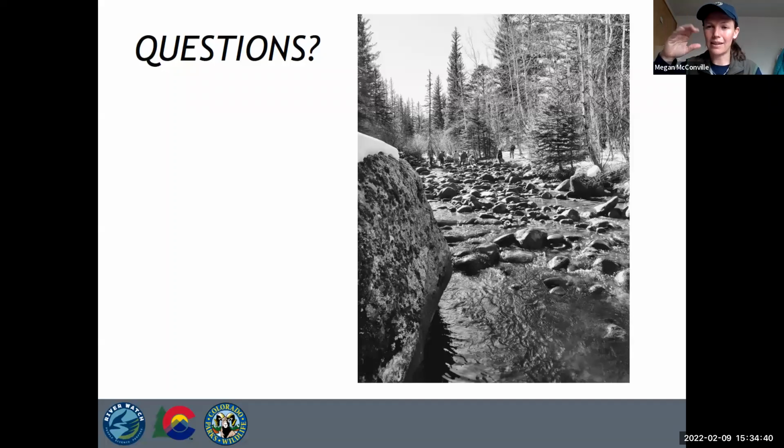So I don't anticipate a problem, if you've had sodium at a concentration that this optical emission spectrometer has routinely measured, the mass spec will be able to verify and get very consistent results. We will also do some testing at the beginning with samples from different parts of the state and look at them on the two instruments and do a cross comparison to verify that there are no issues. But really the biggest piece that's going to change is we're going to lower this bottom end, but the top end will still be able to have really representative data across the picture.